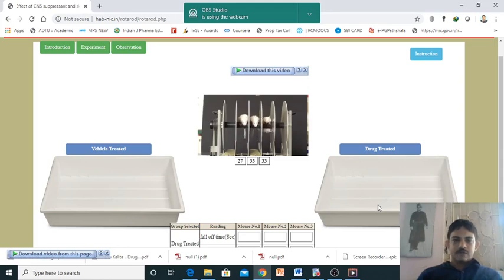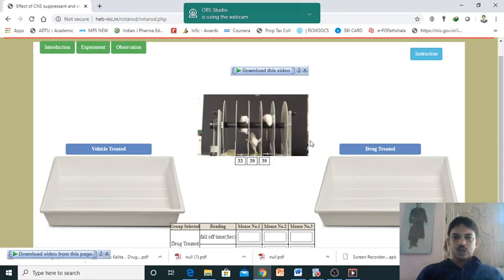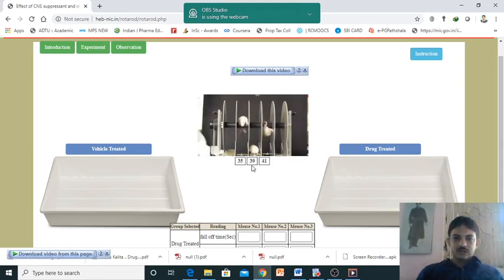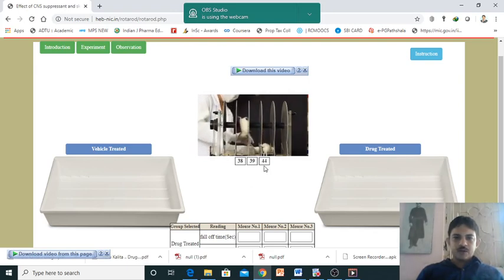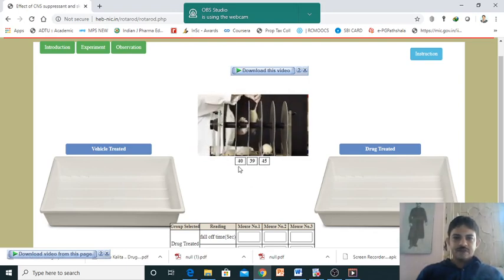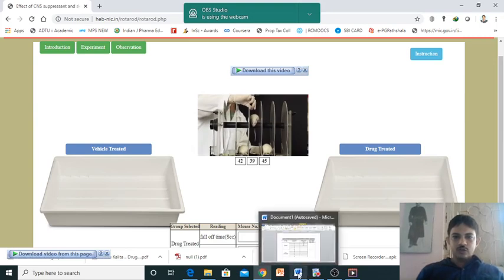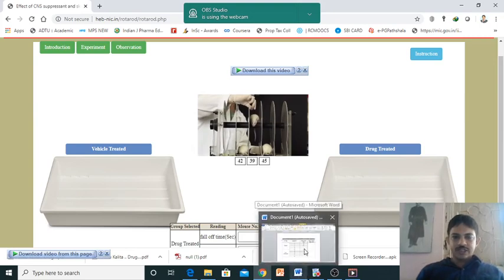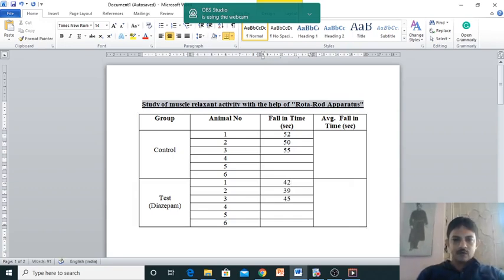You can find the same experiment, but it is the drug treated group. It just falls down - 39 seconds first one, 45 and 42. So 42, 39, 45, 42, 39 and 45.